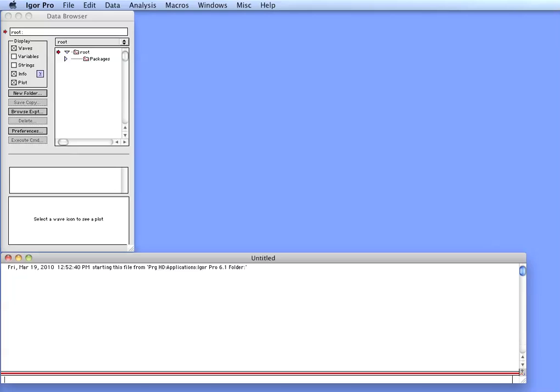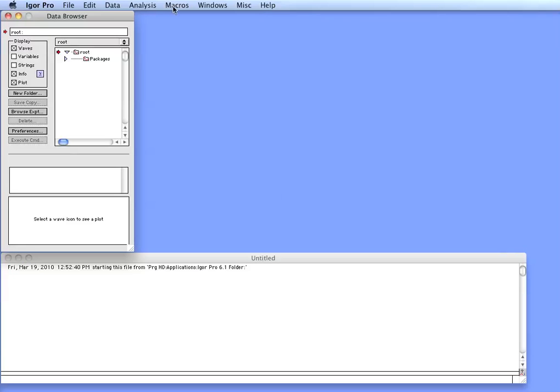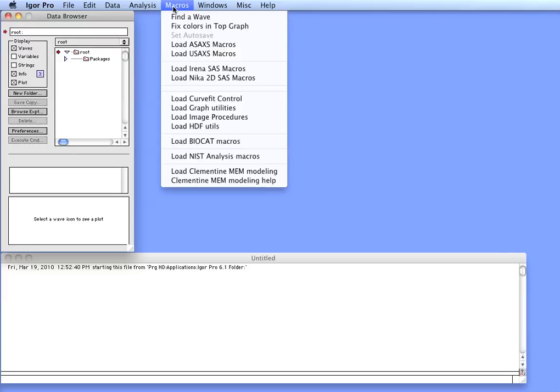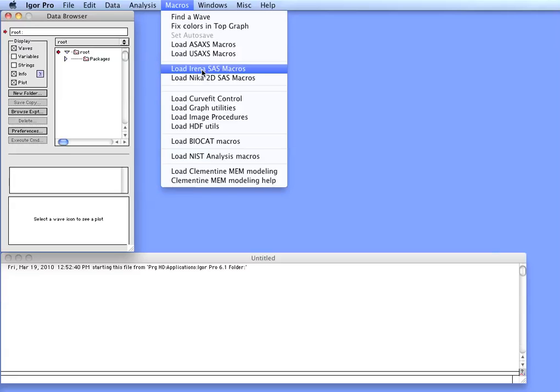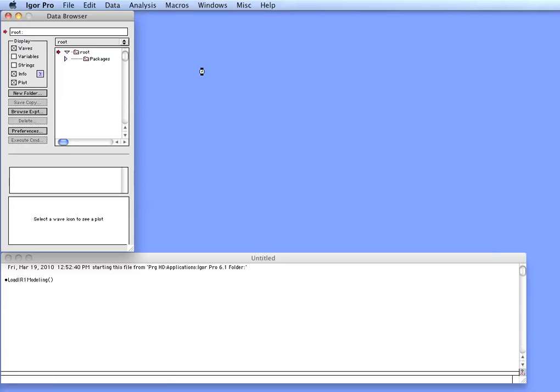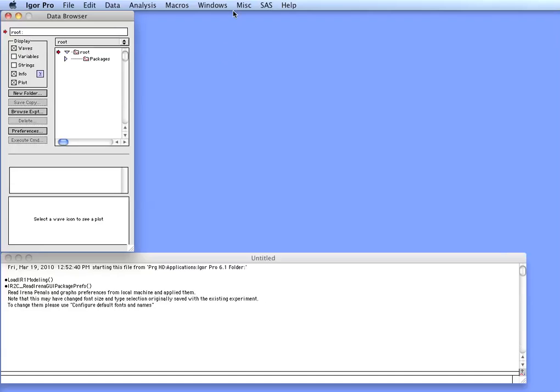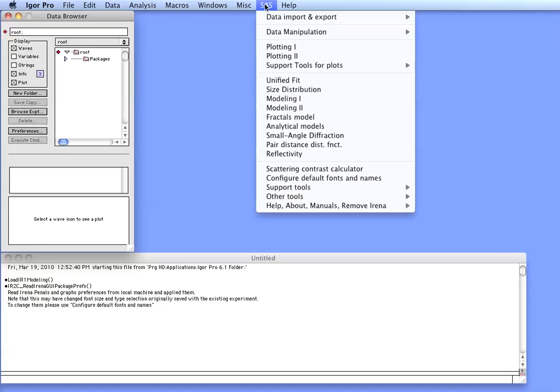As well as the original publications by Greg Beaucage which are referenced in the manual. So in Igor Pro first go to Macros and load in the IRENA SAS macros. After the macros compile, which may take a bit depending on the speed of your machine, the new menu of SAS will appear in Igor.